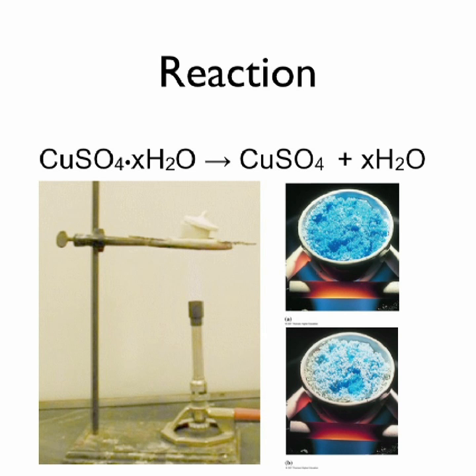Set up a lab burner, ignite the burner away from the crucible, and adjust the burner to get a small flame. Okay, we will be determining the mass of the crucible and cover, and the mass of the crucible cover and the hydrated sample. From the difference of these two, we will get the exact mass of our hydrated sample. Then, as described in the lab procedure, we will heat the crucible with its contents for about 10 minutes.